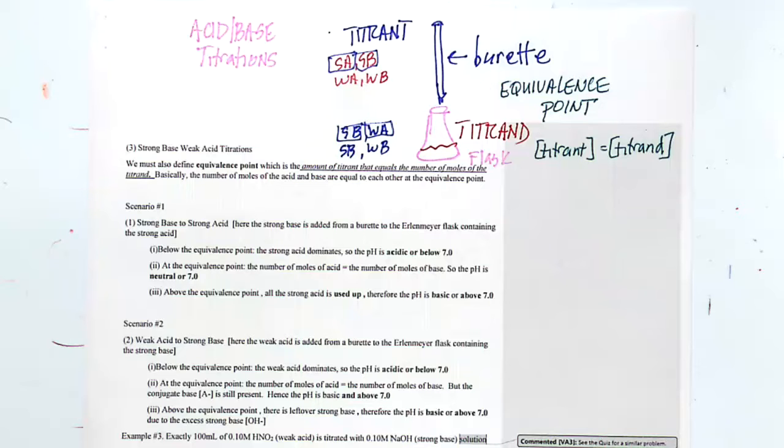Just try not to mess this up, BJ. So you do this like 0.5 mils at a time. You do 0.5 mils, and then you shake it. Then you do another 0.5 mils, then you shake it. Not making sure it's exactly 0.5 mils. I'm reading this line. You guys can't read it because the volume readings are facing me. You can do 0.5 mils at a time, you can do 1 mil at a time. You keep on doing this.